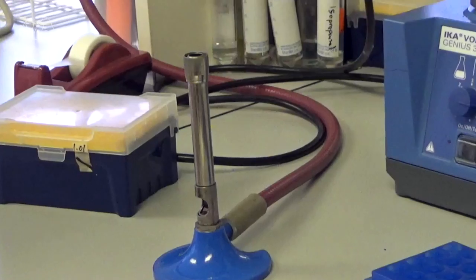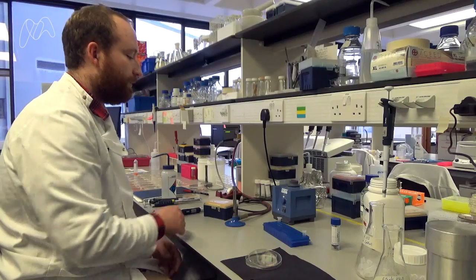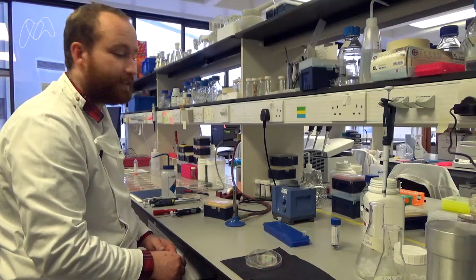So the first thing we've got to do is light the Bunsen burner. The reason we do this is to keep the air around it sterile and prevent it from contaminating the sample.